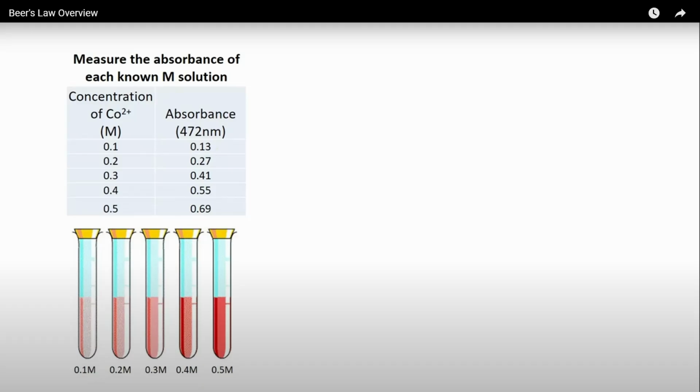What color should that wavelength be? Should be green. Green is opposite red.